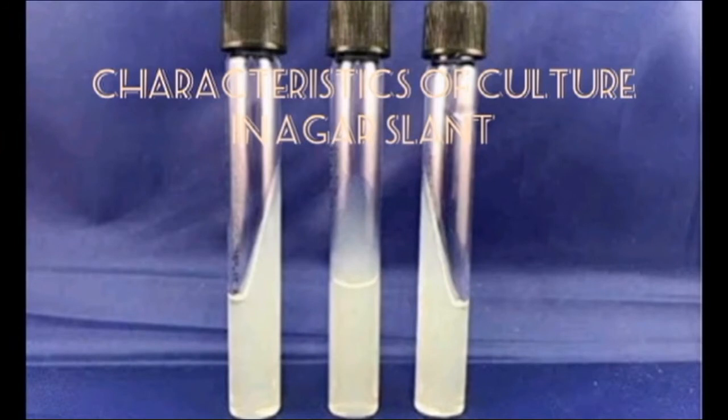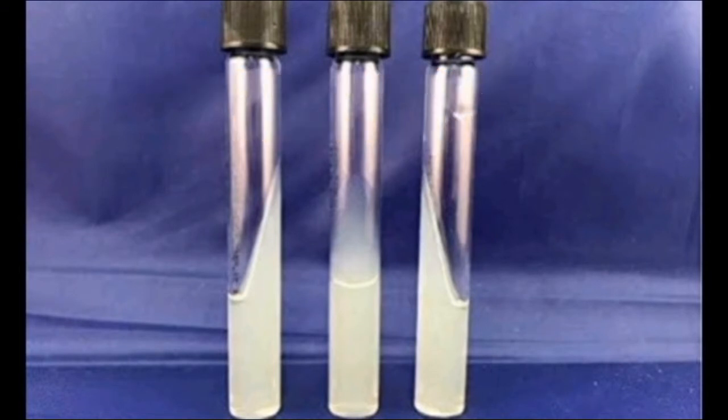Good day, Doc. Good day, classmates. My name is Odilio Van B. Santos, DPM3A. I'll be reporting this day, so my report is ready. In this presentation, I will discuss the characterization of bacterial culture in agar slant. Here I have examples of bacteria and they will identify their culture characteristics. But first, what is an agar slant?